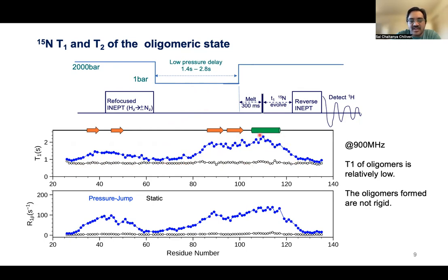These T1 times are consistent with the secondary structural information, where this region has higher T1 relaxation times when compared to the monomeric protein. We can also observe a similar trend of higher relaxation times for the oligomeric species when compared to the random coil structure. Similarly, we also obtained the R2 relaxation rates, recorded as R1 rho relaxation times with a 2 kilohertz spin lock field.